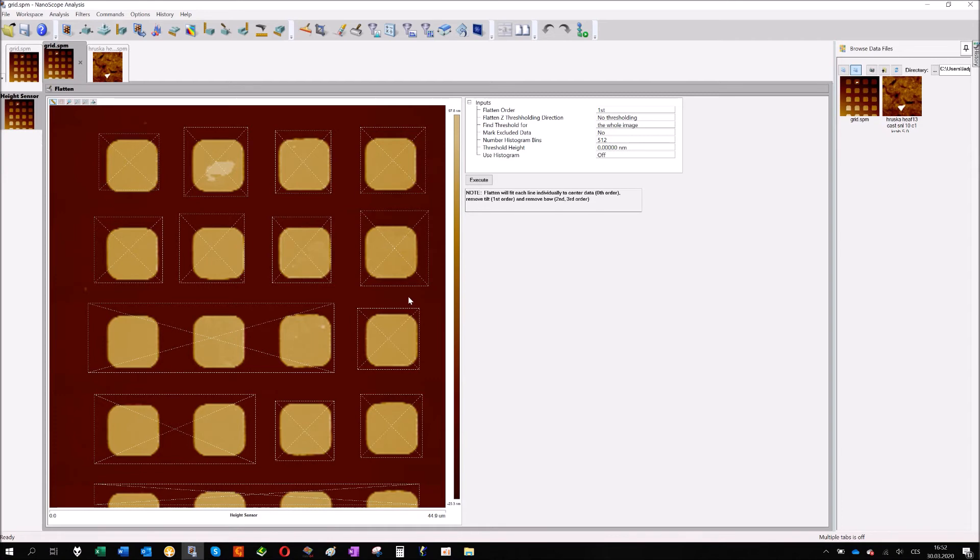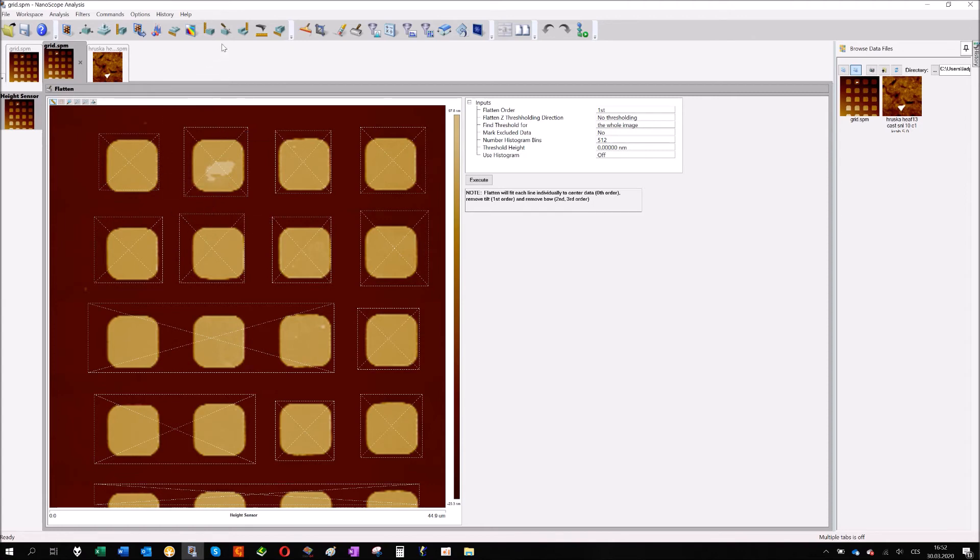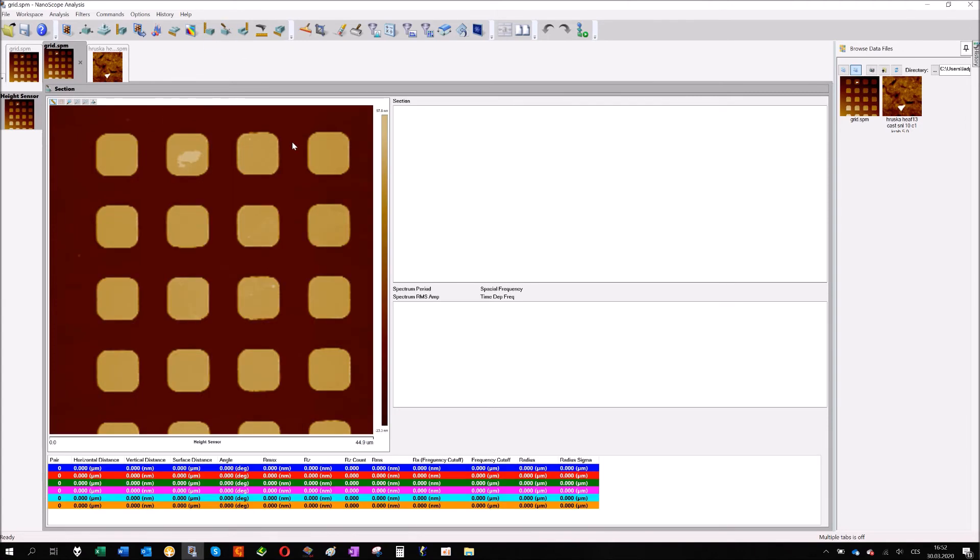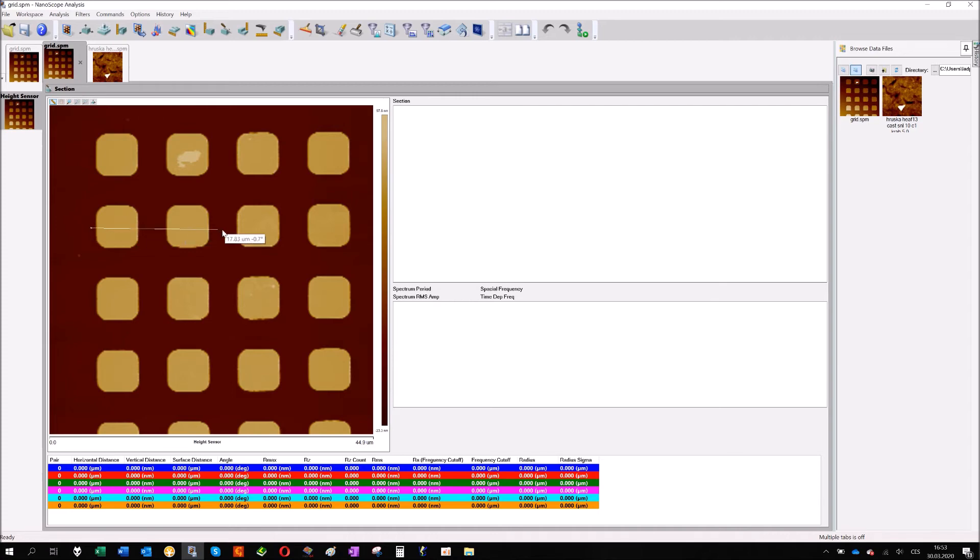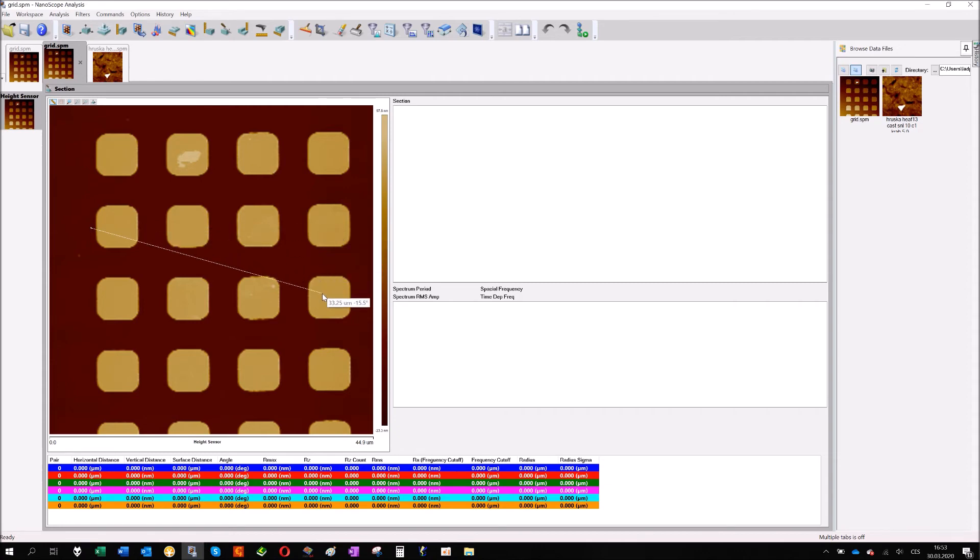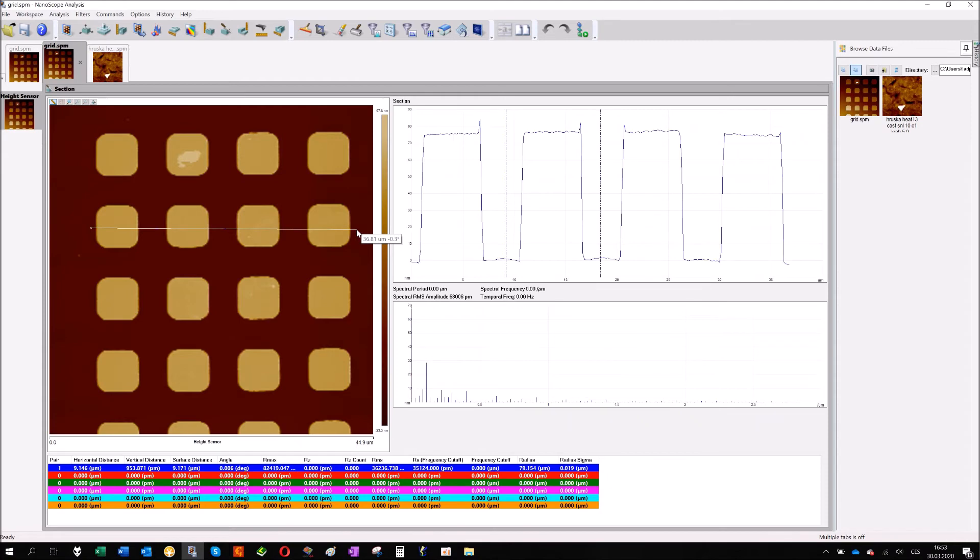To see better what the sample is, I will use the second tool. It's called section. The section is the easiest way how to measure the distance. Very easy, I just click with the left button on the mouse and drag a line. You can already see the angle I'm using and also the distance.